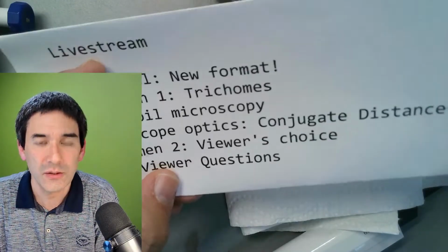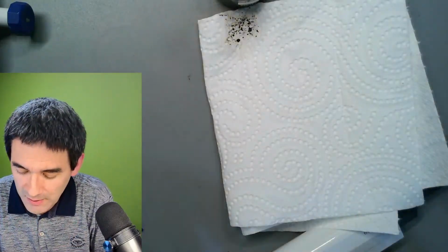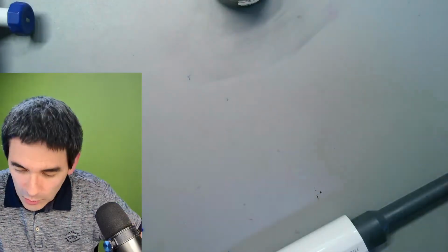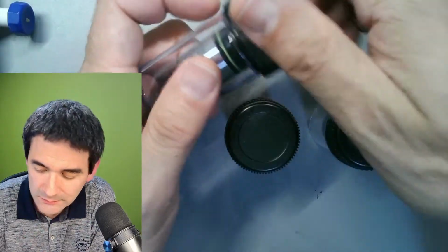Okay. So let me quickly talk for 15 minutes or so about this, because I want to show you a couple of optics, since I've been pulling out my old Olympus microscope again. Just want to show you something. I need to clean up everything here. I've got a couple of microscope objectives here.